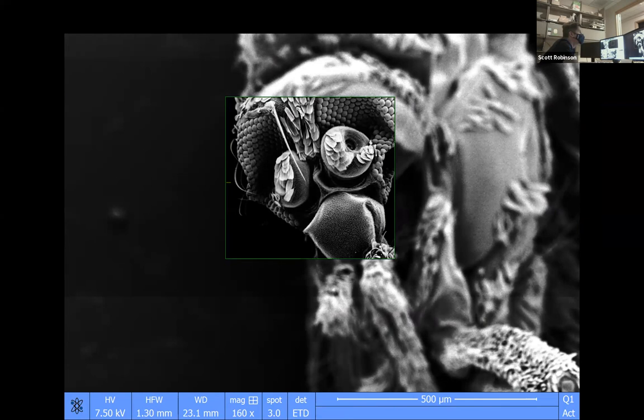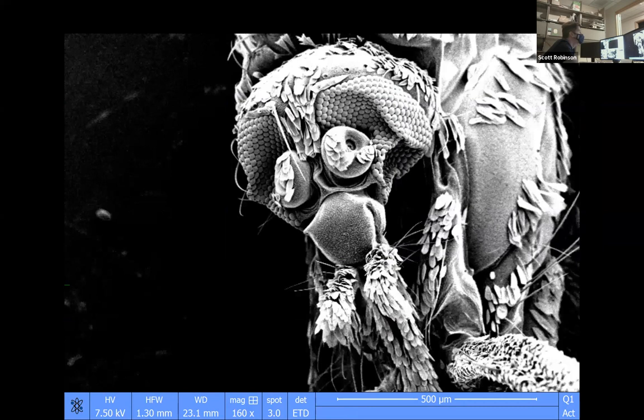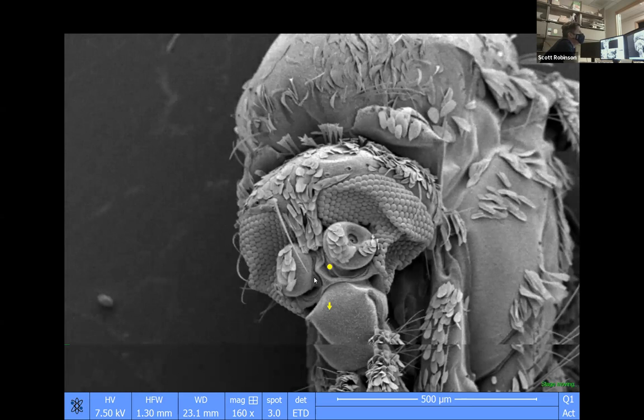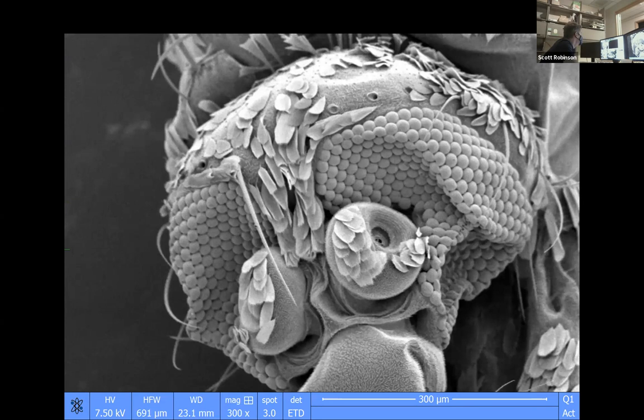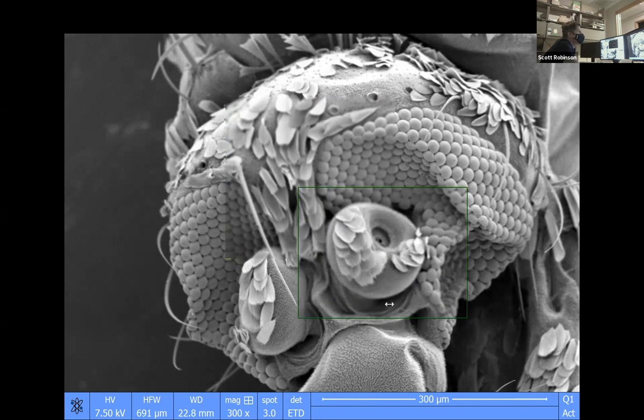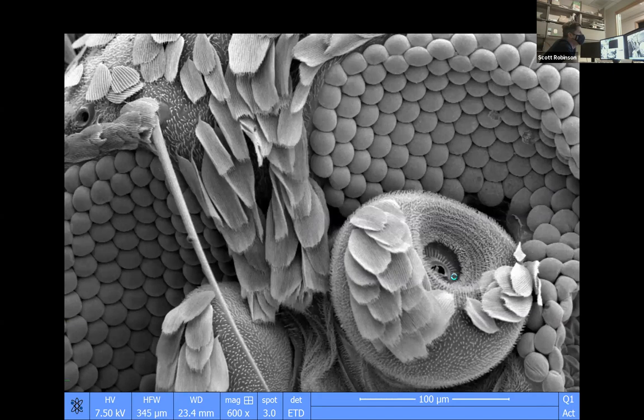I have a question, Scott. When you're adjusting the brightness and contrast, are you doing that by changing a property of the electron beam, or are you just adjusting the image in post so it just changes what we're seeing? It's the second. We just have the ability to control the brightness and control the contrast. So it's something you could do on any video screen, I think. But people normally don't need to change the contrast and brightness on their TV, for example.